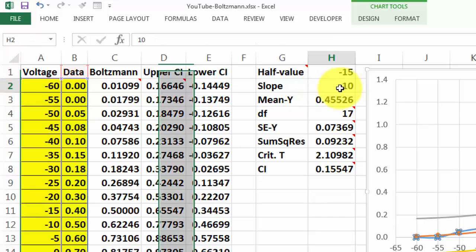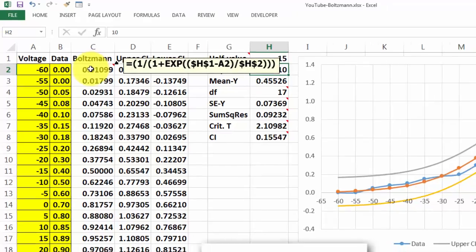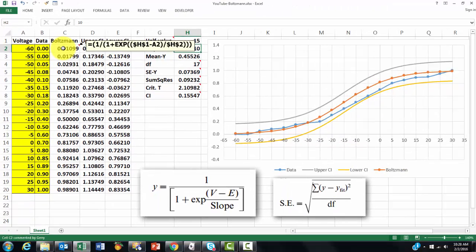The slope is an educated guess. How much does it go up for each new value? And then we are going to implement the formula for Boltzmann. I put it right there. It uses the halfway value and the slope. It uses the exponent function.